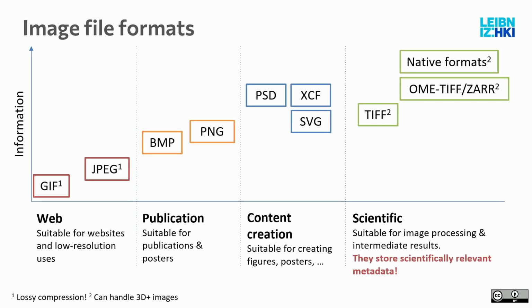That's why I made this chart. It's useful for you maybe, with these image file formats and where you should use them. So we have here GIF and JPEG. These are very compressed formats that are suitable for putting on websites or something. So they are very, very small.